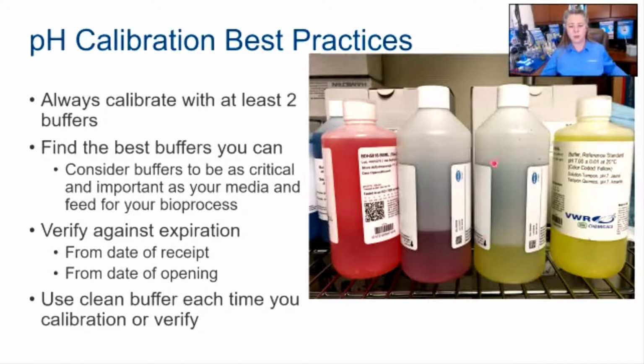These two center ones are the ones they were actively using. And I asked them, those buffers are not the right color. Oh, we just shake them up. Don't worry about it. They're fine. They're not fine. The color of your buffer is really important. It's an indicator. The worst case, and they didn't let me take a picture, was one buffer almost as full as this, open for a while, bright pink on the bottom and dark purple on the top, with a full gradient in between. I asked them what they did. They said, oh, we just shake it up, make it one color. It works fine. The answer to that is it doesn't.